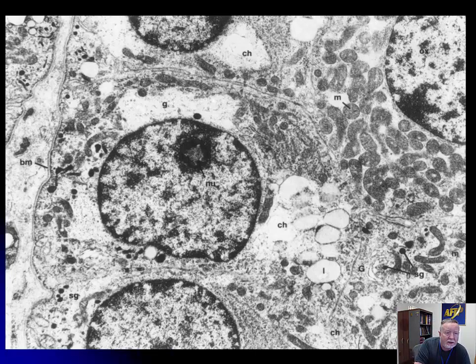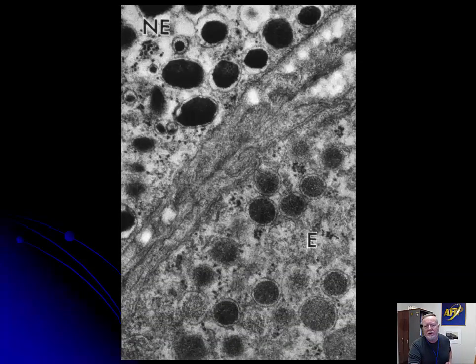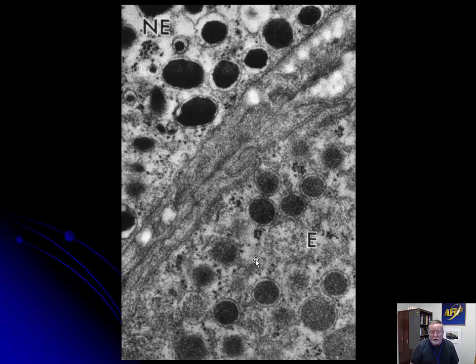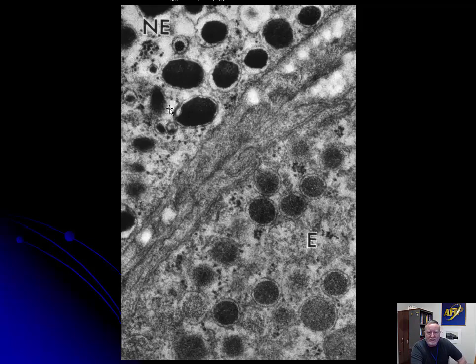While talking about secretory granules, we can look at the adrenal medulla, which also has dense core secretory granules just like we saw in the pancreatic islets. A piece of interesting trivia: there are two types of cells in the adrenal medulla that look identical under histology — those producing epinephrine and those producing norepinephrine. The epinephrine-producing cells have centrally placed dense core granules, while the norepinephrine-secreting cells have eccentric granules that are not centrally placed.